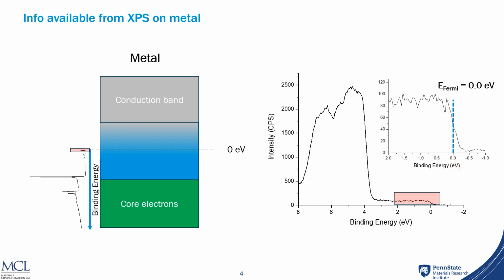So this is the Fermi edge, or the Fermi level of this metal, as all metals should have, and that should reside right at 0.